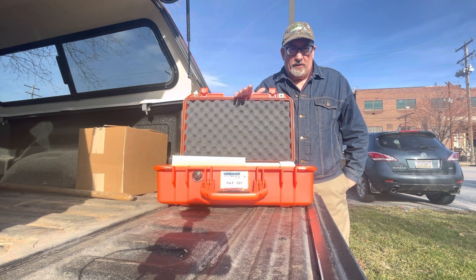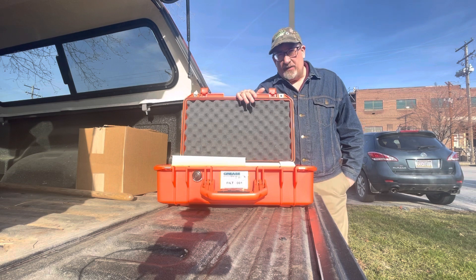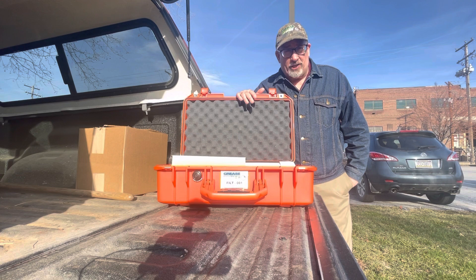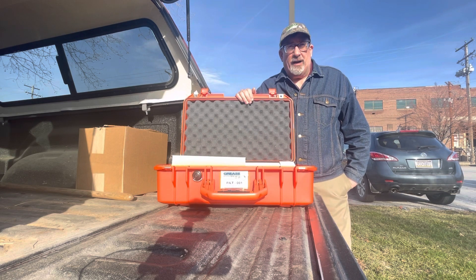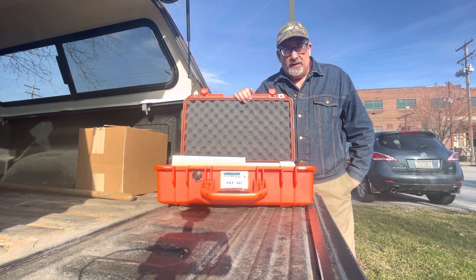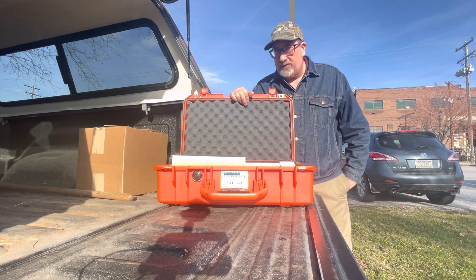This is a kit that we've developed for the collection of filters for the purpose of analysis. There's a lot of information that you find in a filter that usually ends up in the trash. Often folks don't know exactly what to do with the filters — they're messy, they're leaking oil out. It's hard to get them in a condition where you feel comfortable shipping them to a laboratory for this kind of analysis. We've solved that problem by creating a kit that addresses all these things.